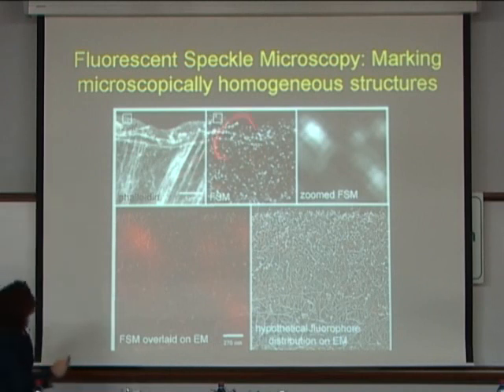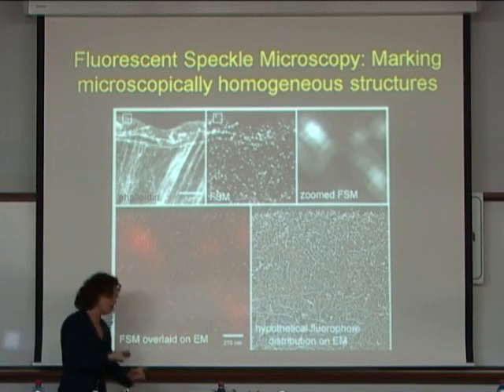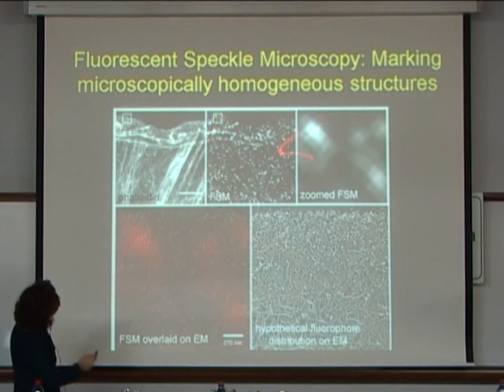So this is the fluorescent speckle microscopy image, where what we've done in this case is biochemically isolate the actin, chemically link a fluorophore to it, and micro-inject those chemically labeled actin subunits back into the cell. They incorporate into this structure, but this is all you see. So what does each one of these speckles represent?